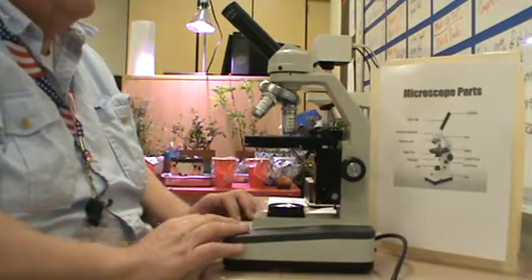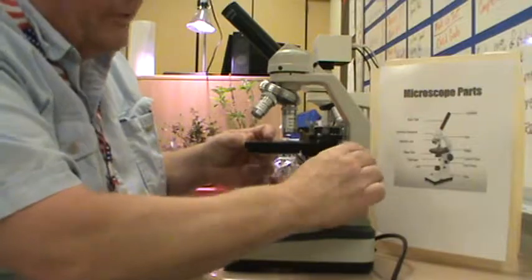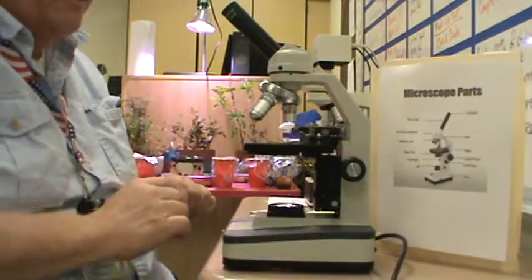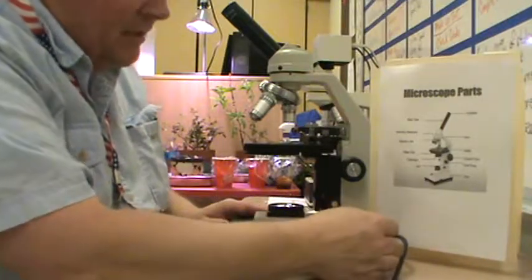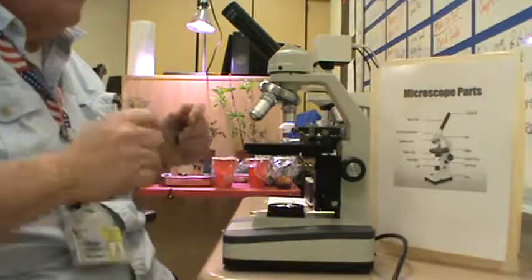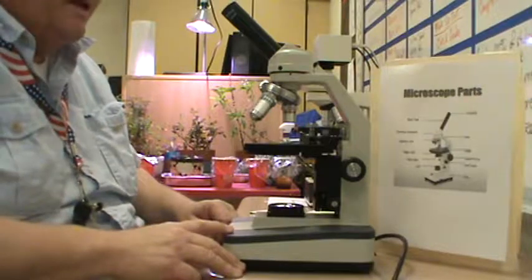When you're done using your microscope, please make sure and roll the stage down. Roll this back to low power. Unless you're allowing other people to use it, turn your light source off. Put your slide away. Of course, you'll have a cover for your microscope, and then you're done for the day.